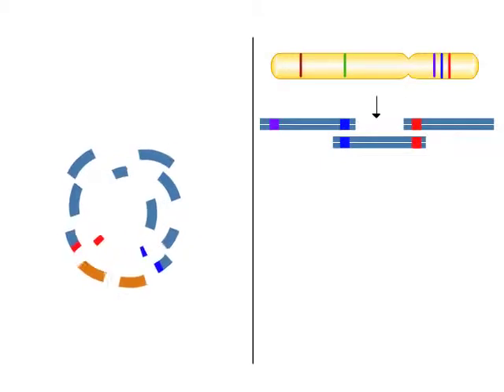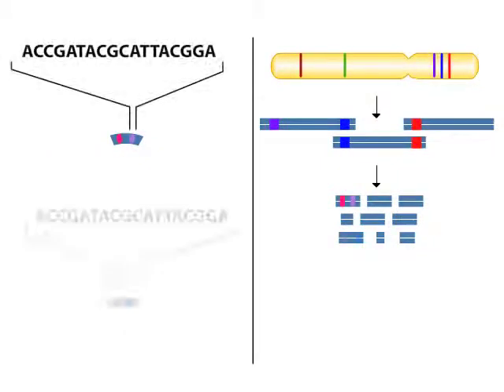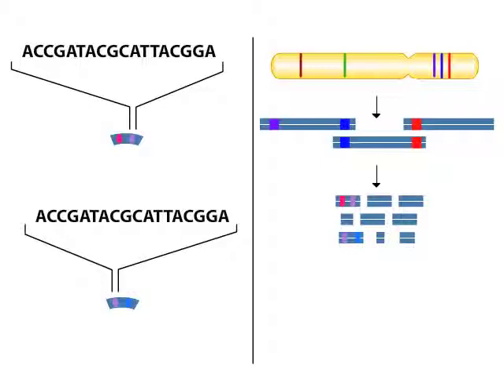Yet, before a large fragment can be sequenced, many copies of it are first randomly cut into smaller fragments. After a multi-step process of isolating and replicating the small fragments, the DNA of each fragment is sequenced. Although each fragment is sequenced from end to end, we color only small areas to indicate identical sequences among fragments.